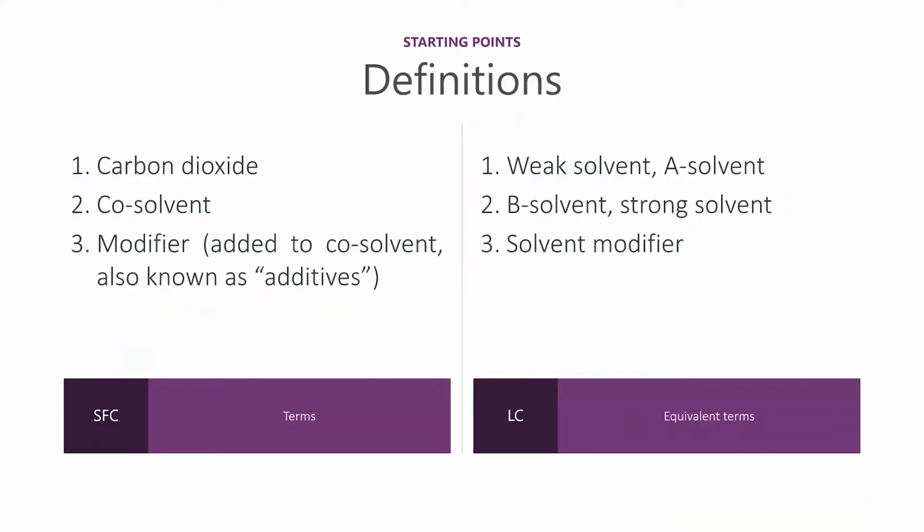This page compares SFC to regular liquid chromatography. SFC has different terminology because it was once considered an offshoot of gas chromatography. The terminology survives even though SFC is now considered to be normal phase chromatography.